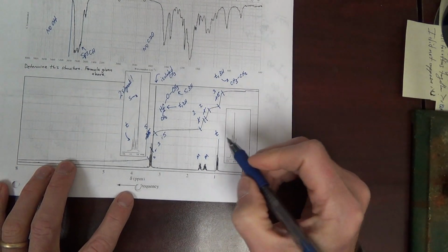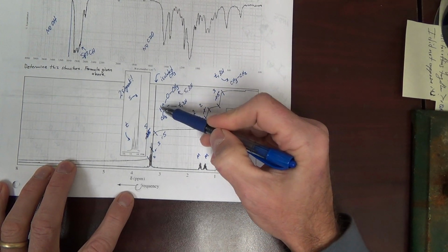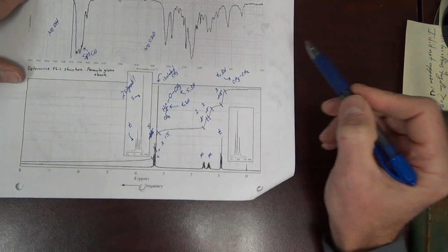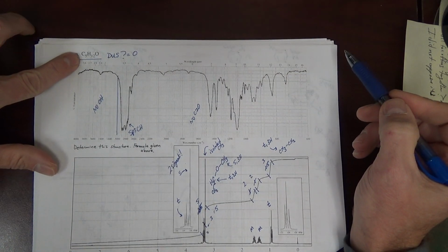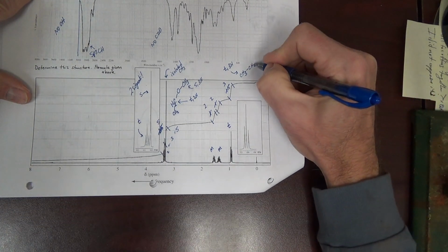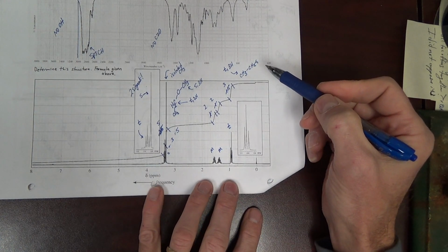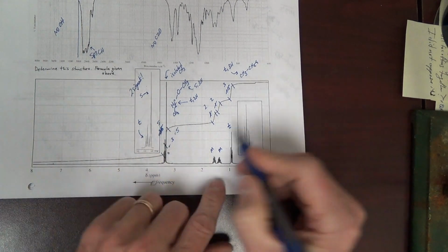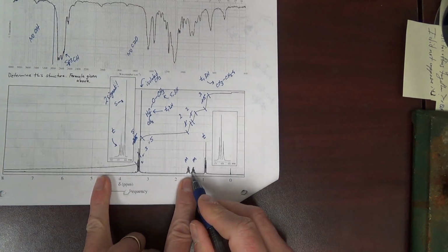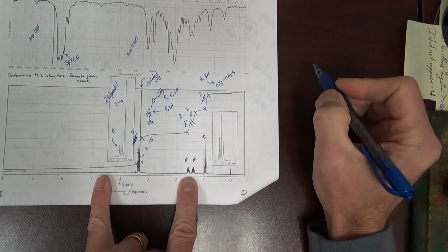Okay, we're starting to get fragments on the paper here. I have 1, 2, 3, 5 carbons. Well, that's good. The compound has 5 carbons. All right. I have two other signals. Hopefully, these other signals are for the other parts of the fragments that I've put together.